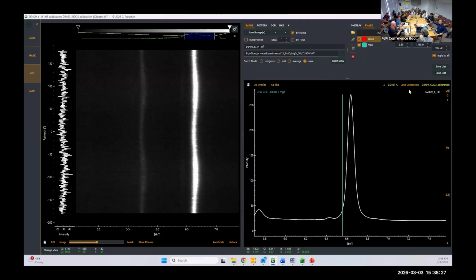It helps you guide where you want the experiment to go. If you want to target pressure, you can just collect diffraction during compression until your peaks line up with the place that you want to go. Dioptas is really good as an on-the-fly measurement and comparison tool during the experiment to get you where you want to go. It's not the end-all, be-all theoretical model. Sorry, Dioptas isn't really for analysis so much. It's just a really nice GUI to cycle through images.